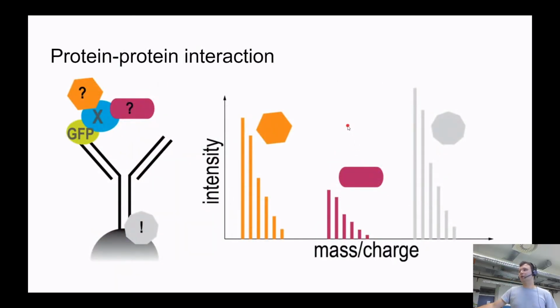Okay, proteomics, one of the gold mines of proteomics is also protein-protein interactions. And one of the simple things you can do, you can just attach a certain tag to protein X, the protein which you would like to know with whom it is interacting. You can attach, let's say, the tag GFP. Of course, it's a huge tag, but it's very easy to get because many people did microscopic measurements of many proteins. Anyway, so we have a specific antibody against this tag. Of course, we may have a very specific antibody against protein X, but it's not a very scalable solution. So anyway, what we are doing, we are incubating this fusion of protein X and GFP inside of lysate or inside of cells. And next, we just pull this protein using this tag and check out with whom protein X is interacting.